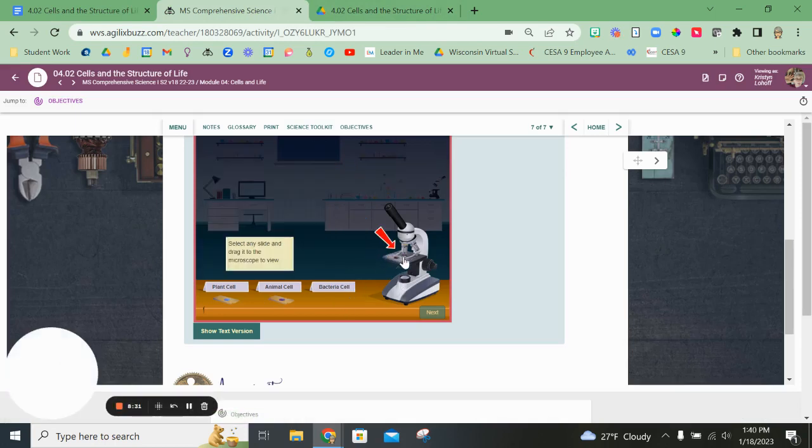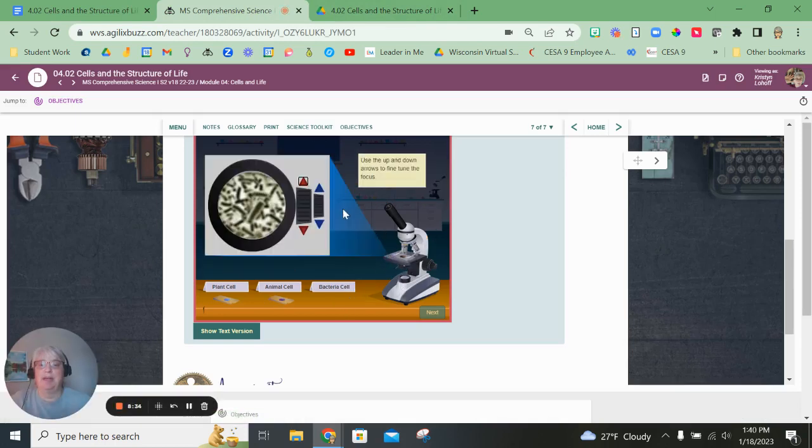So coming in here, we put the bacteria cell in, turn on the microscope, hit our buttons to get the bacteria. Oh, look at that. These are bacteria cells. This shape of bacteria is called a rod shape. Record observations in your lab report, then select Next to move on to the self-check.